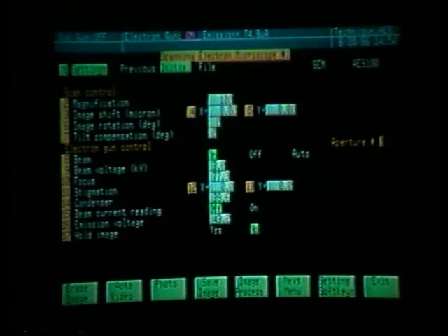Since the sample is a relatively flat sample and is uniform, we do not need a small beam for the analysis. What I would like to do is use about 3 microamps of current so we get good signal to noise to demonstrate the profiling routine. I would also like to use 10 kilovolts of beam voltage, again so we get good signal to noise and we can more easily see high energy transitions.